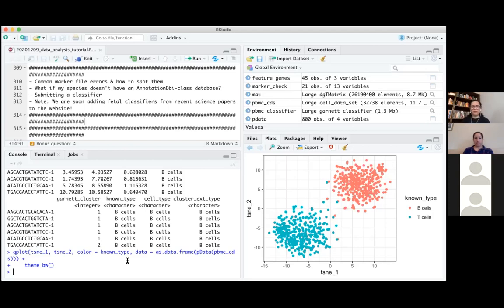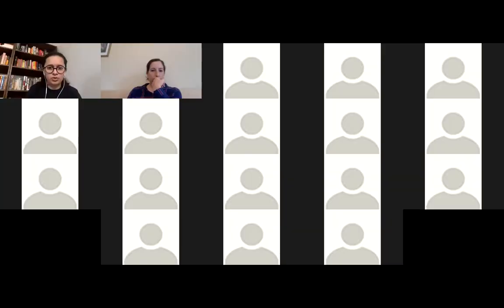I just wanted to cover one last part, and I'll have to switch to the PowerPoint for that. I just wanted to show you the common marker file errors that you can spot in time so that you don't go through the process and have to redo it. So I'm just going to switch over to the PPT.